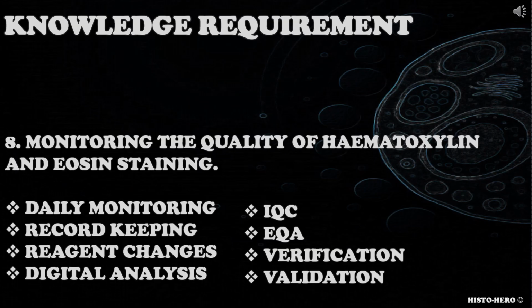When addressing this knowledge requirement, candidates should consider daily monitoring, record keeping, change of reagents, role of digital image analysis, role of IQC and EQA slides, verification and validation of reagents.